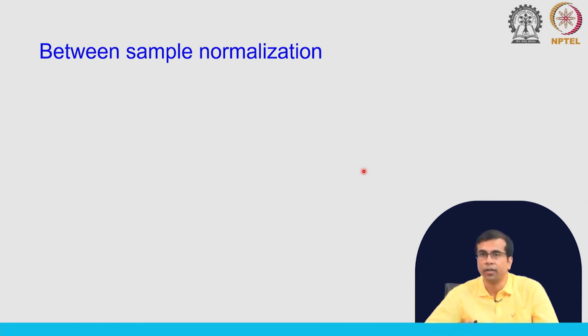So, we do the gene length and also divide by the sequencing depth. So, this is within sample normalization and we are not comparing across samples within a data set. So, this becomes very important in many analyses that we do. Okay. So, one of the major applications of RNA-seq is to do something called differential gene expression analysis.